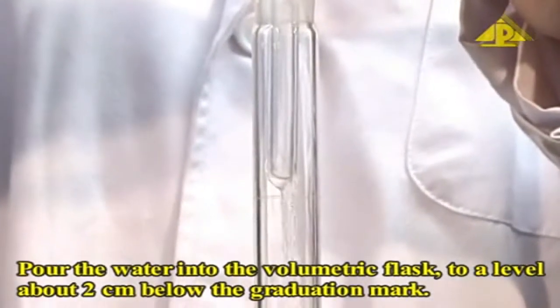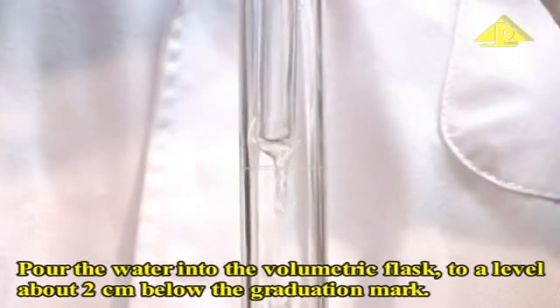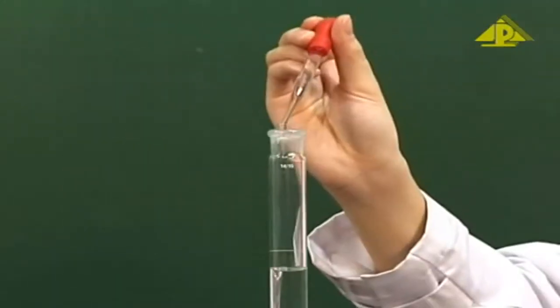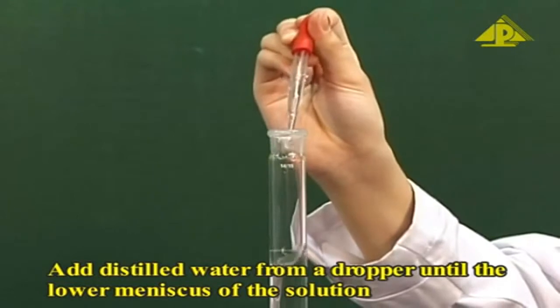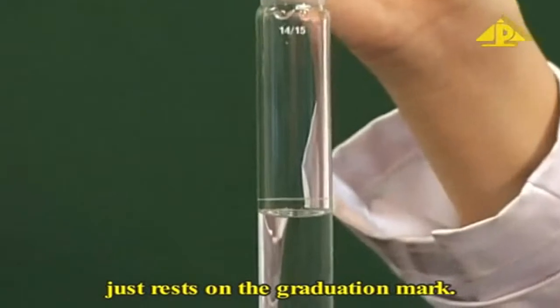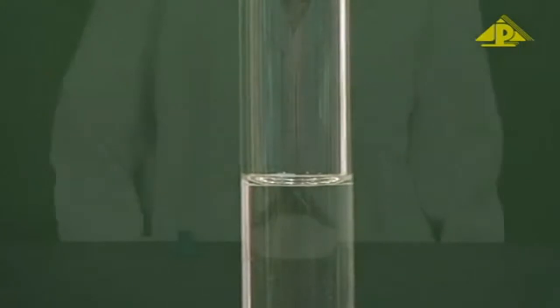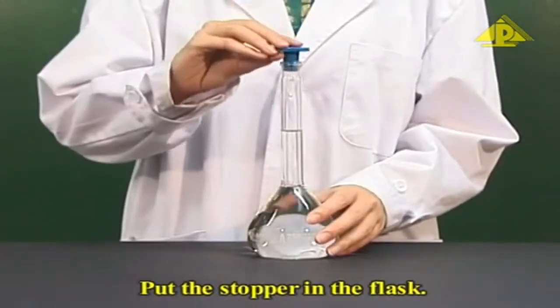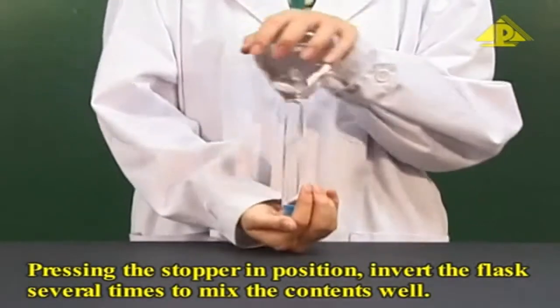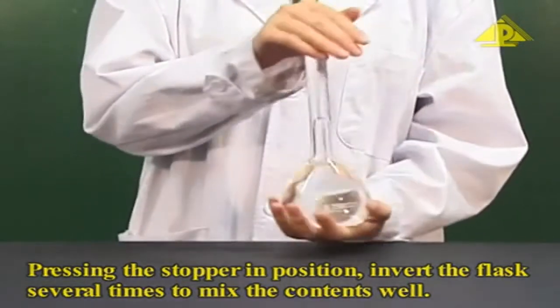Pour the water into the volumetric flask to a level about 2 centimeters below the graduation mark. Add distilled water from a dropper until the lower meniscus of the solution just rests on the graduation mark. Put the stopper in the flask. Pressing the stopper in position, invert the flask several times to mix the contents well.